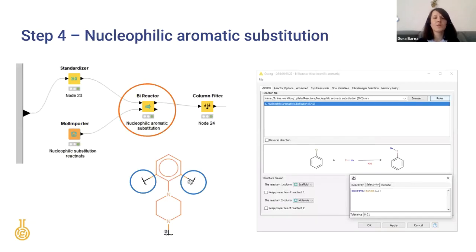And then we are going to use this concatenated product molecule collection as reactants in functionalizing the amine nitrogen. But before we go there, I would like to show you how these substitution reaction and virtual reaction steps can be used in KNIME. Here in this virtual reaction and virtual library building, the key step and the key node will be the Bimolecular Reactor node, also from the JChem extensions.